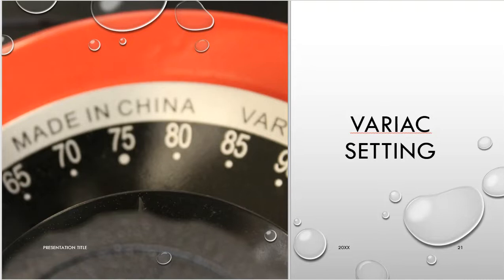The 30 minutes actually hasn't started yet, and the reason is because it says a 30-minute reflux time, and reflux means the first drip. So that is where the time is actually going to start. So I'll give that to you in just a minute. But just because I turned the heat on, this does not count toward the time of the actual reflux. It means refluxing for 30 minutes, not turn the heat on and then wait for 30 minutes. There is a difference in that laboratory procedure direction.